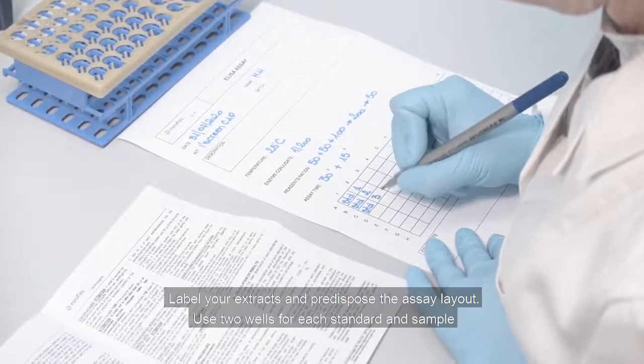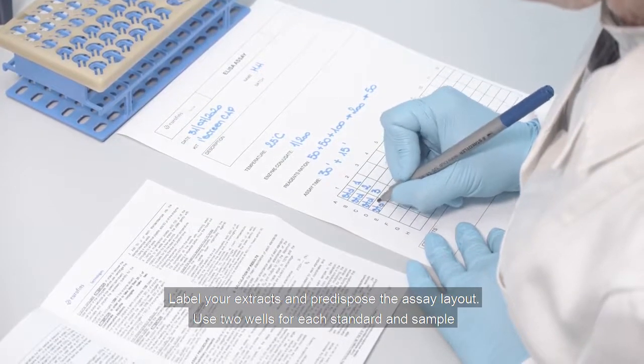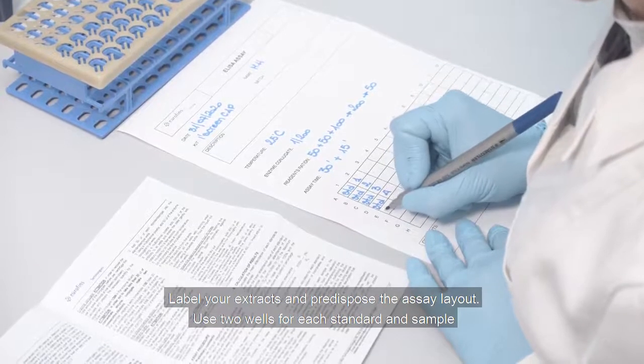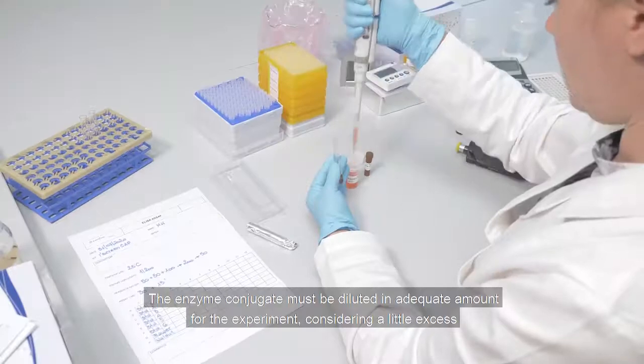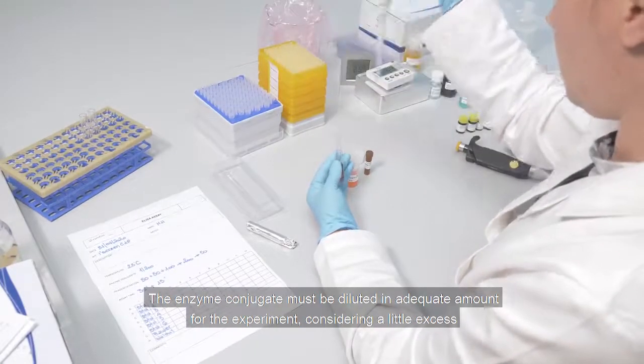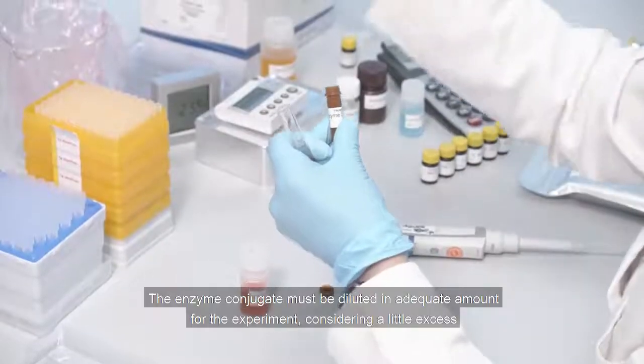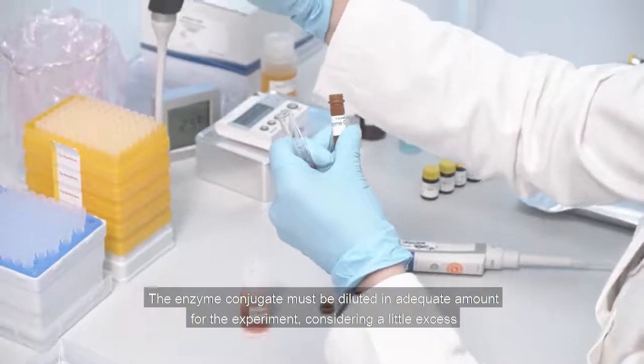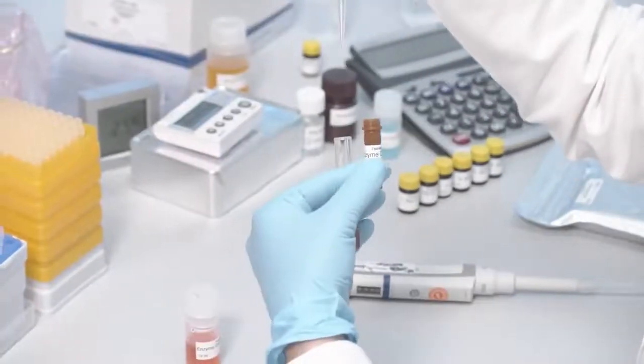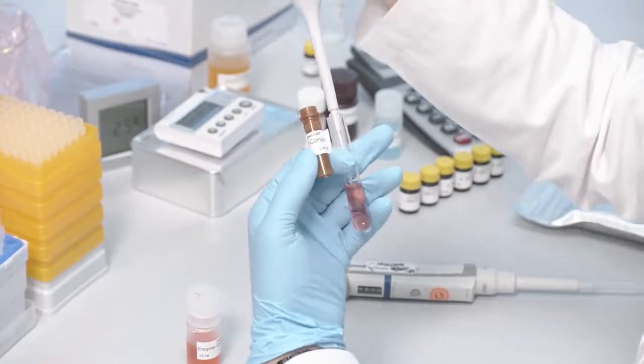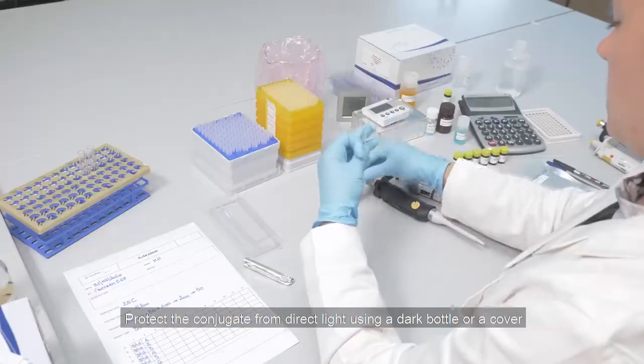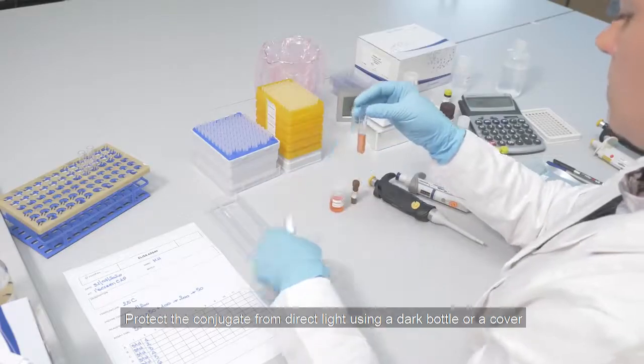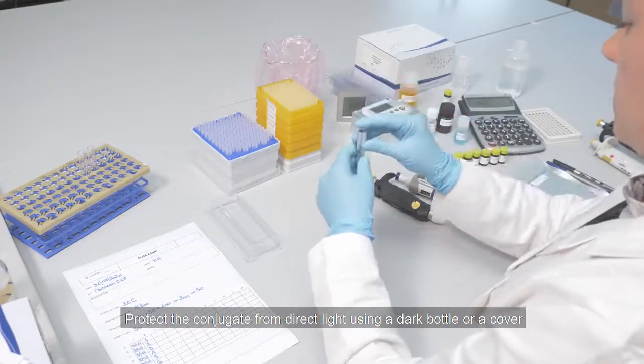Label your extracts and prepare the assay layout. Use two wells for each standard and sample. The enzyme conjugate must be diluted in adequate amount for the experiment, considering a little excess. Protect the conjugate from direct light using a dark bottle or a cover.